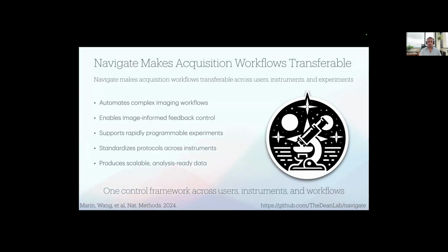But the whole idea is we can now automate complex imaging workflows. You can do event-driven microscopy so that you can change the way the system operates, maybe go from a fast imaging mode to a slow imaging mode or vice versa, or have a macro scale view, identify a feature of interest, and zoom in. Or you could even have things like adaptive optics where you're now running an iterative routine and adjusting the wavefront to see if you can optimize the performance of a microscope.